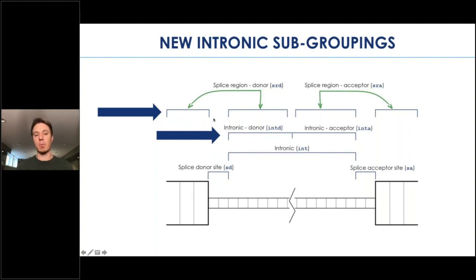An example of where this helps, it might be if the codon that borders an intron, let's say, is the G459 location, then you might have a synonymous variant like G459G, which you might ordinarily look over. But in this case, it would additionally be categorized in Mastermind as a splice region donor variant. So it might indicate that you shouldn't look over that synonymous substitution, because even that synonymous substitution can affect splicing in a significant way.